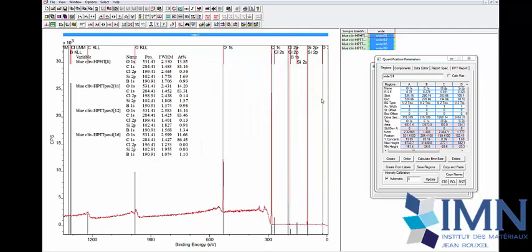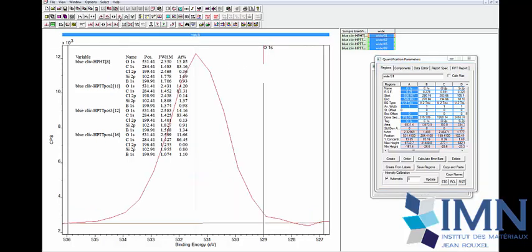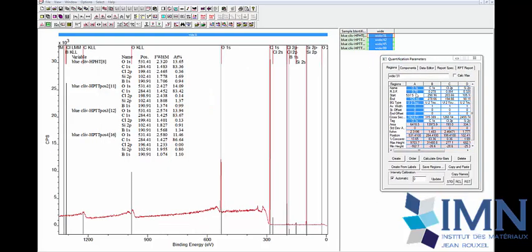So we want to propagate to the other samples. It's done, and with this display we can see directly the 4 sample results. Now we will check region by region, the oxygen 1s first, and we adjust the display windows to have a good view. We adjust the limits left and right to have a good choice, and the good choice has to be, in an ideal case, if it's possible, one that works for all the measurements together. It means when we modify one parameter, we will be able to propagate it to the others in an easy way and have a kind of self-consistent measurement.